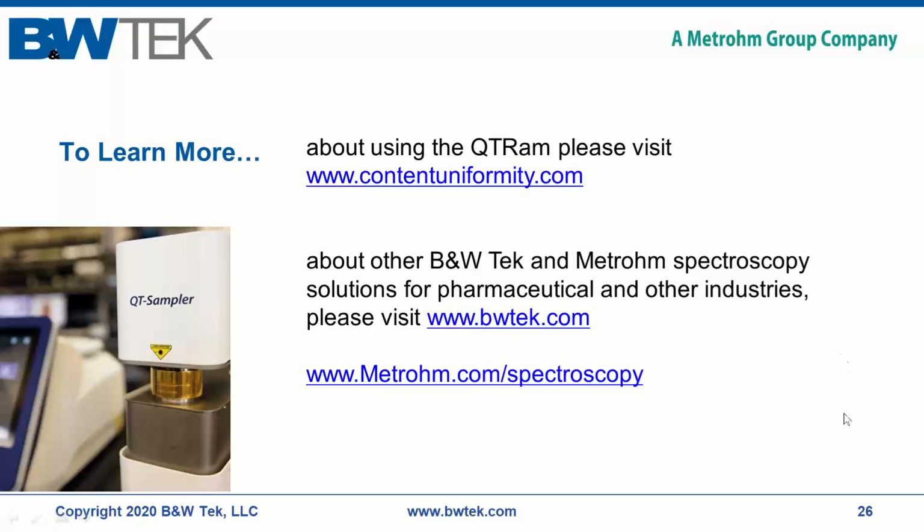Great. And our next question, how does the amplification cavity affect the likelihood of sample burning, and is this often an issue? Actually, under this current design, because we are using more defocused light than typically in Raman, where we have a focused light over a very small sample area, sample burning is not seen as an issue. So that's a good question. So you're not reflecting back a highly focused light. You're taking back the reflections from that diffusely reflected light to enhance the signal.